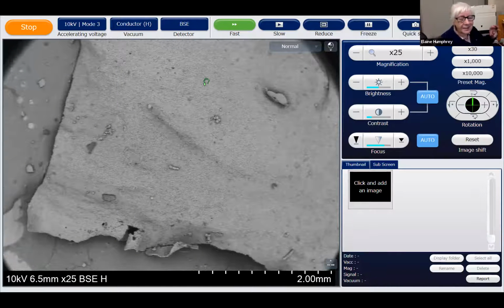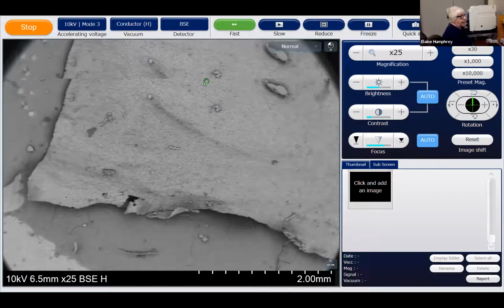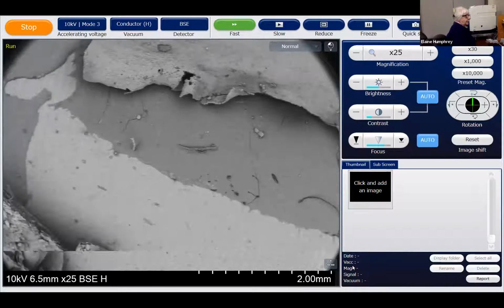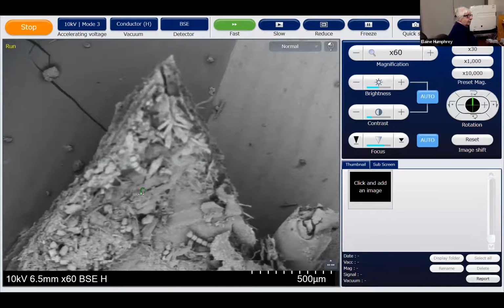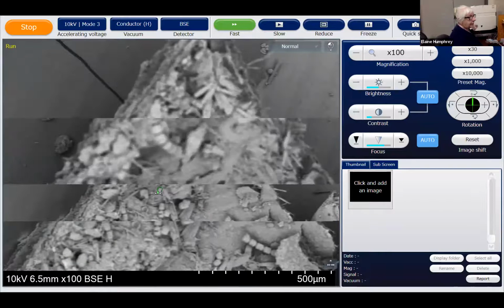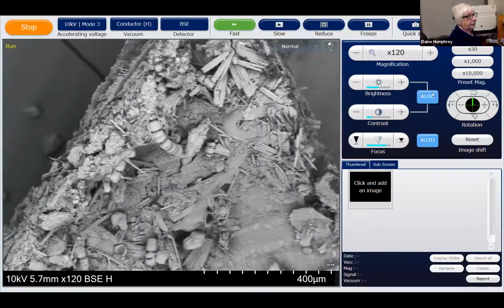So that's the top end. If we move down through to the medial end, the middle of it, we find, this is the stub. We find another piece that I've got here. And now we find we've got a lot more. There's a lot more coming in on this piece. And it's out of focus. So we click on the autofocus button, and we click on the auto brightness contrast, and we do a slow scan.